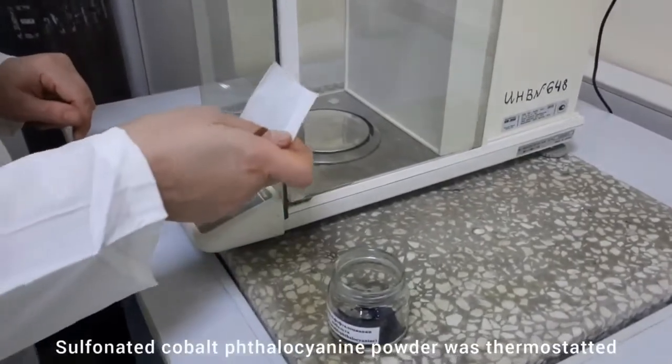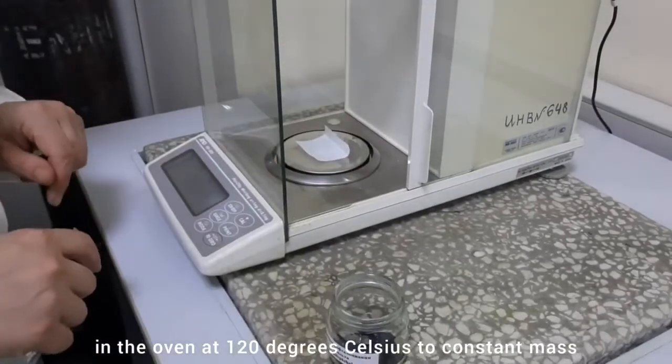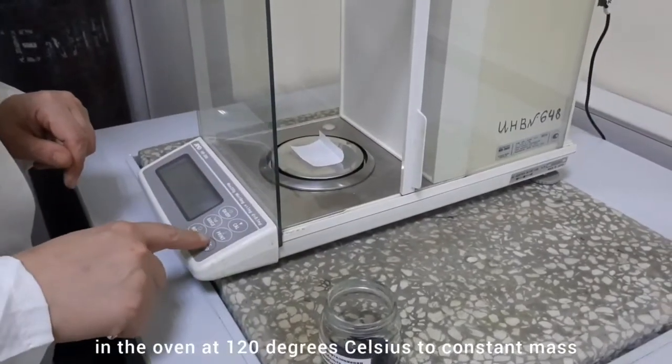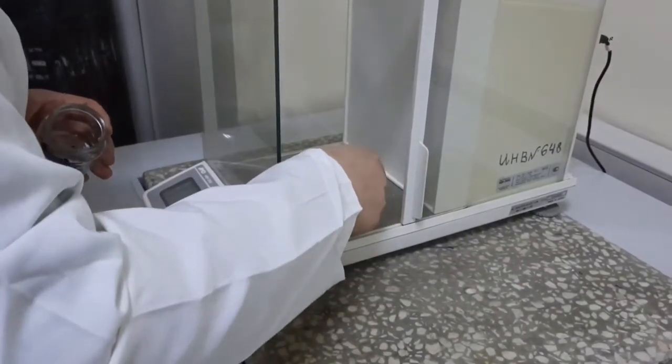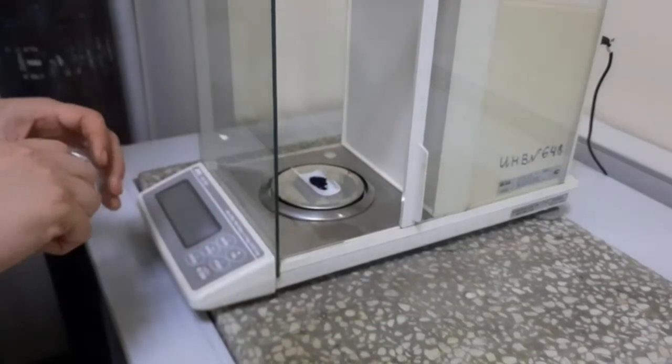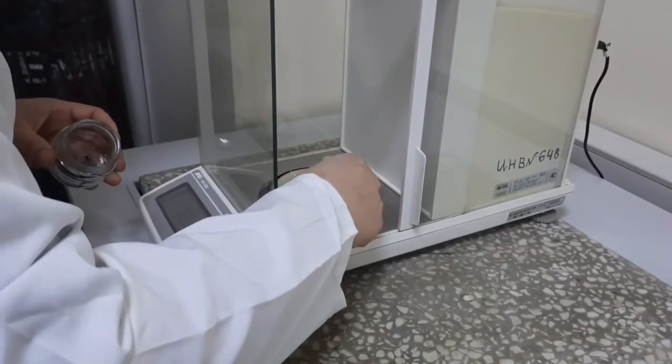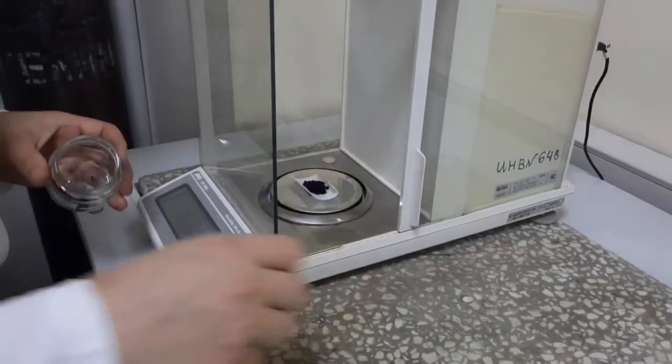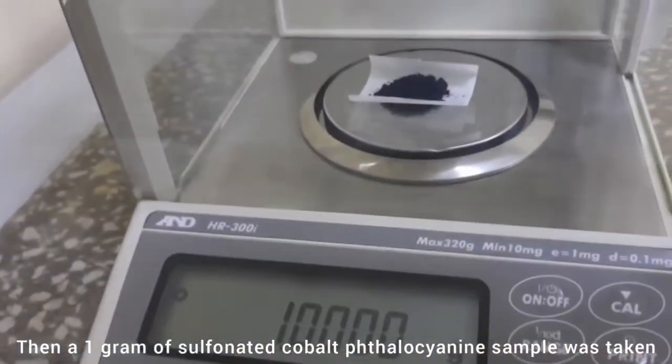Sulfonated cobalt phthalocyanine powder was dried in the oven at 120 degrees Celsius to constant mass. Then a 1 gram sample of sulfonated cobalt phthalocyanine was taken.